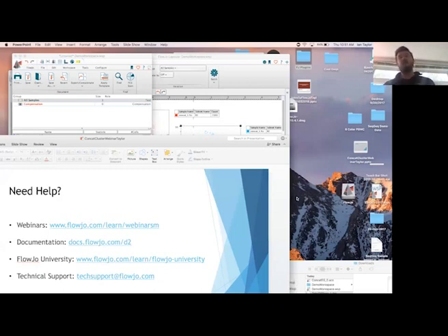So if you need to adjust the gates and you're concerned about the t-SNE being recalculated, you could do the t-SNE on an exported data file in a new workspace. But in that case, when you adjust the parent gates, that won't apply to the exported population. So I'm not sure if that gets around the problem, but it's maybe an interesting thought to export your data into a new workspace.